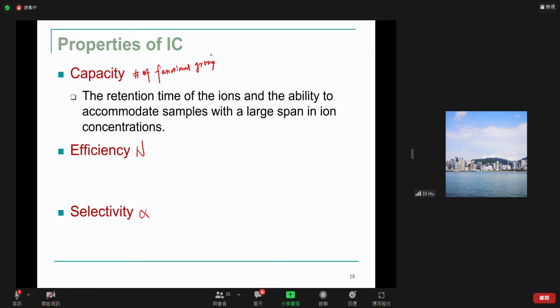But however, the problem is, if you have a higher density of binding sites, then you can handle more sample, but you need a stronger mobile phase for elution. You have a higher salt concentration, a higher concentration of the mobile phase for elution. And if you're using a conductivity detector, that provides an unnecessary burden to the conductivity detector. We talked about that.